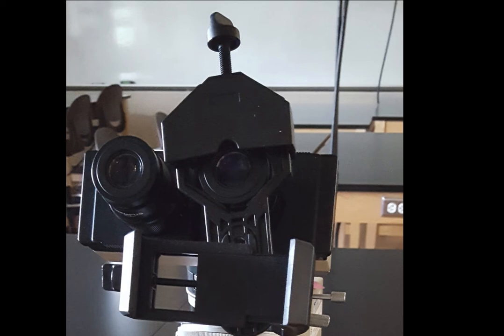It takes a little monkeying around. You've got to get everything centered properly. But once it's set up for your cell phone, then it's pretty easy to come back to the same setup over and over and shoot videos pretty consistently.